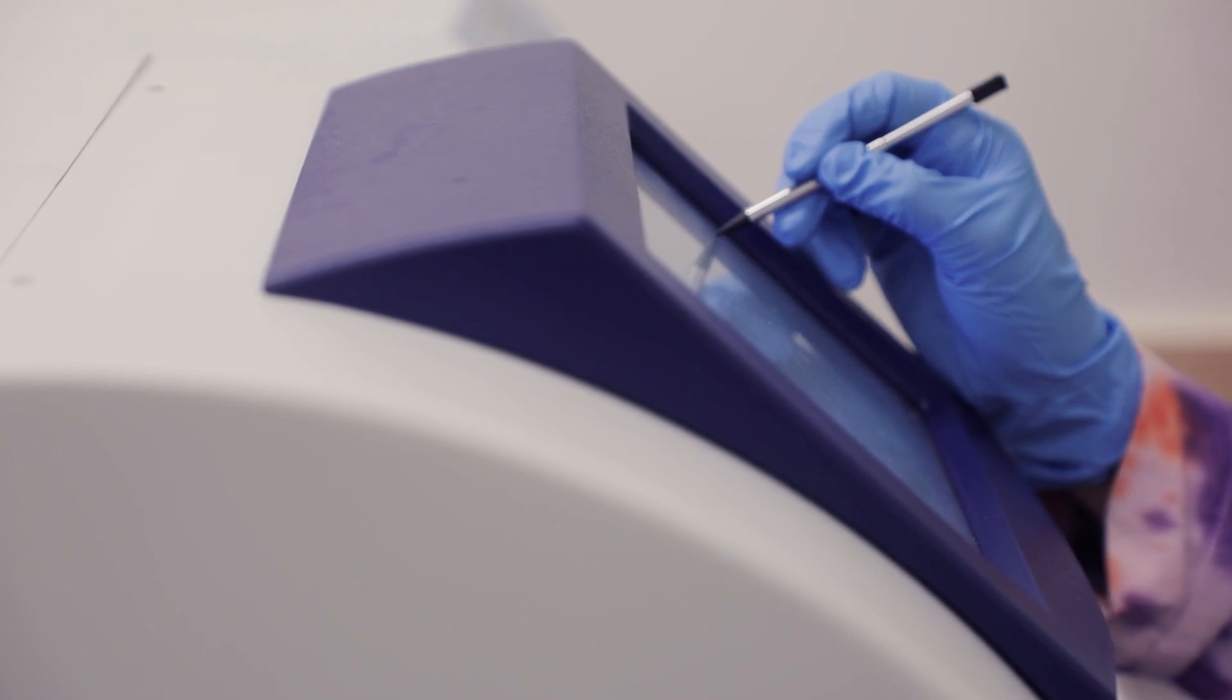So the micro-ESR that we have supplied by Bruker is a new technique that our students are getting to learn this year. It's a very small and compact instrument. It's easy to use. The students took no more than five minutes to basically see the basic operation.